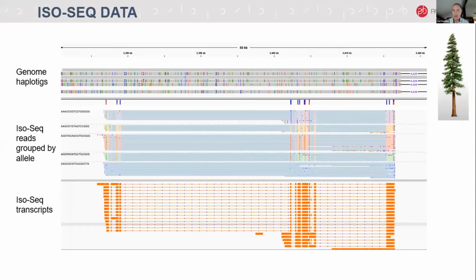Very, very difficult to do anything with this with short-read sequencing, but there's some software that was used, called IsoPhase, which was able to separate the alleles based on the variants within the coding regions. It actually pulled out 5 alleles for this particular gene, because the variation between 2 of these haplotypes was not in the coding regions. It was only in the non-coding regions where you could pull them apart. So effectively, the software rightly called 5 alleles, but 2 of them were essentially identical within the coding regions.